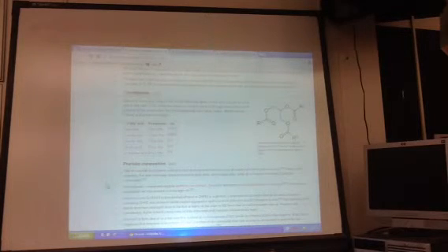If you look at your pre-lab calculations, we're going to be using 12 grams of sodium hydroxide, that's lye. And here's the other neat thing. If any of you decide after doing this lab that soap making is a neat hobby that you'd like to take up, you need something to do in your spare time, you think your siblings are smelly and you'd like to make them some soap for Christmas, you want a hobby where you can go to craft fairs and sell soap. I don't know why.